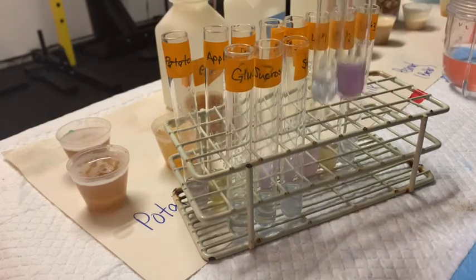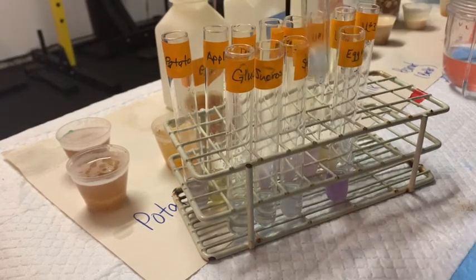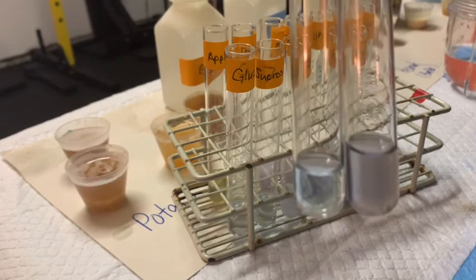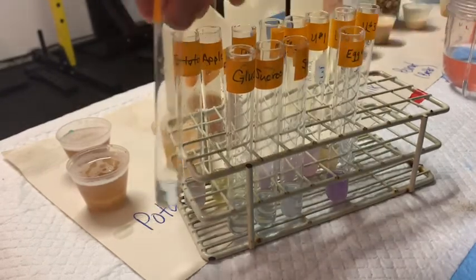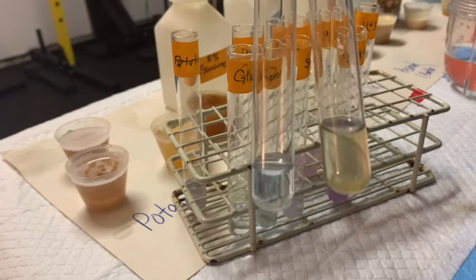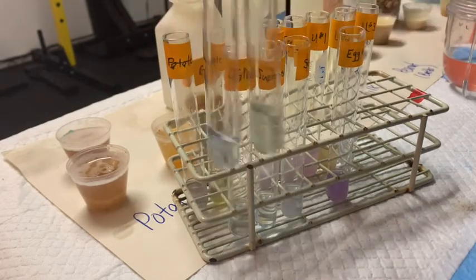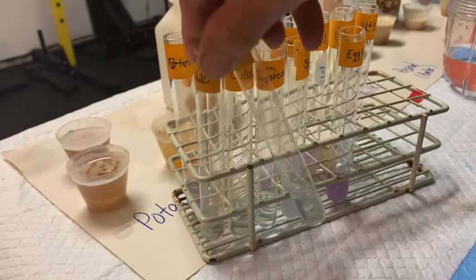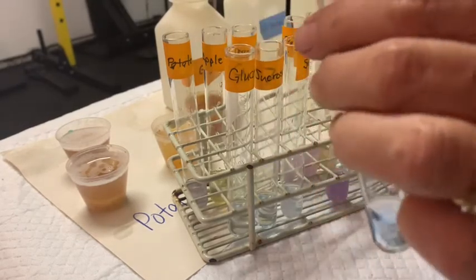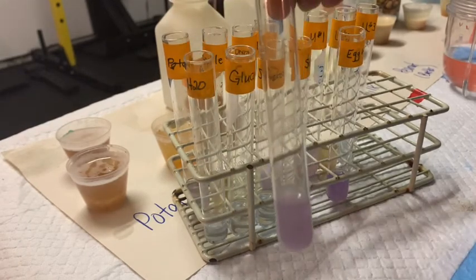Now I'm going to compare water to egg whites — look at that difference: no protein versus protein. Going down to our foods: water and potato — there seems to be a little bit of a purple tinge to the potato, so I would call that a positive. Water and apple — the apple really didn't turn any color. Onion and water — again, not really a positive reaction there. But now look at water and milk — that's a definite positive test. Water and peanut butter — looks just like the milk.